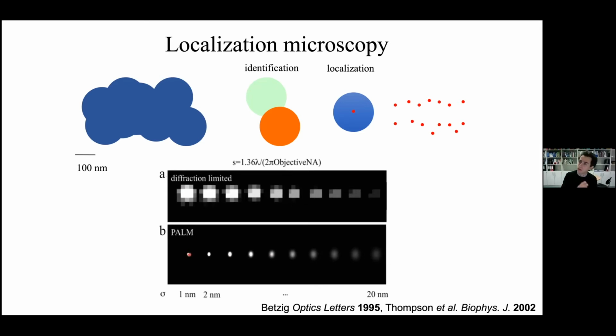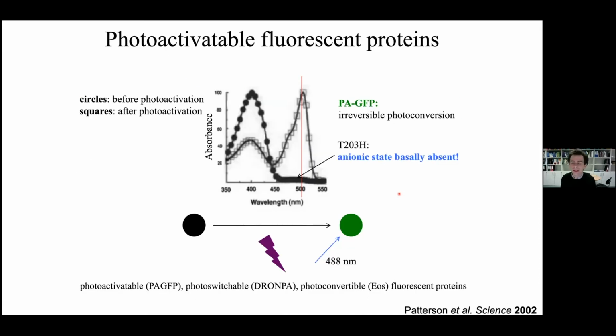And we're getting now closer to the higher resolution microscopy I was showing you earlier. Of course, how do you implement this practically? One approach is to use molecules that can switch between a dark and a bright state. These are called photo switches.